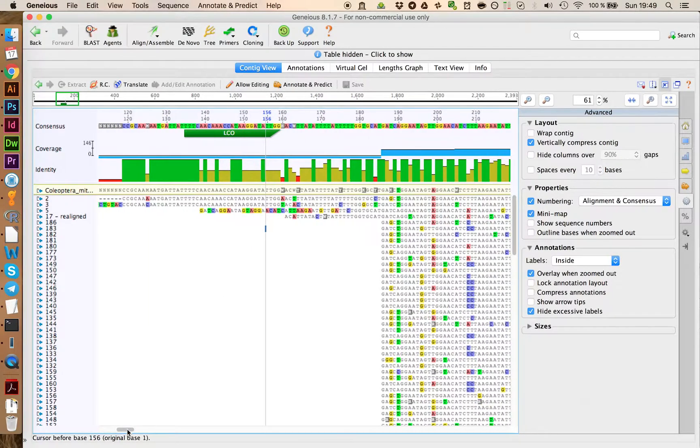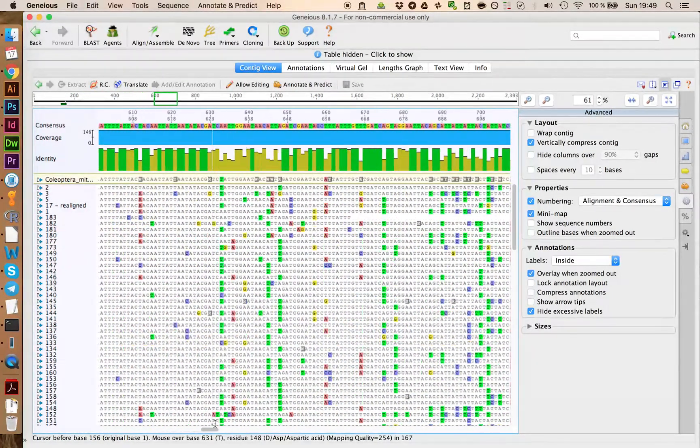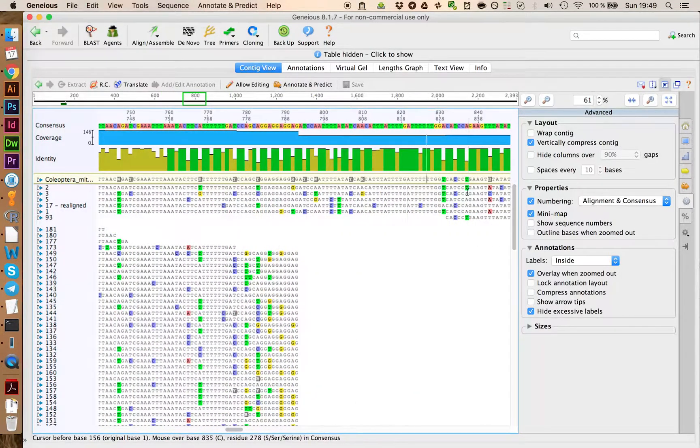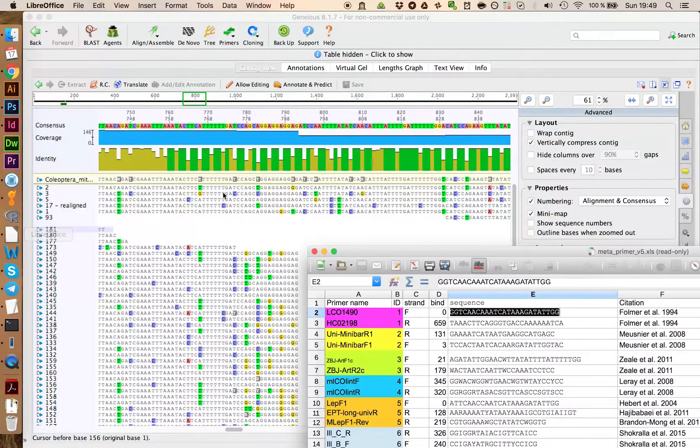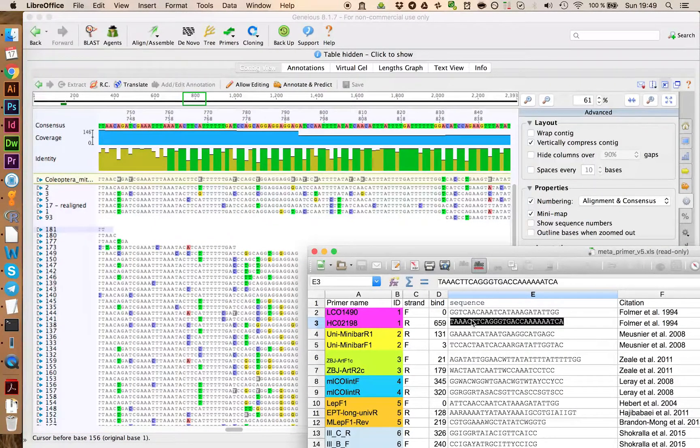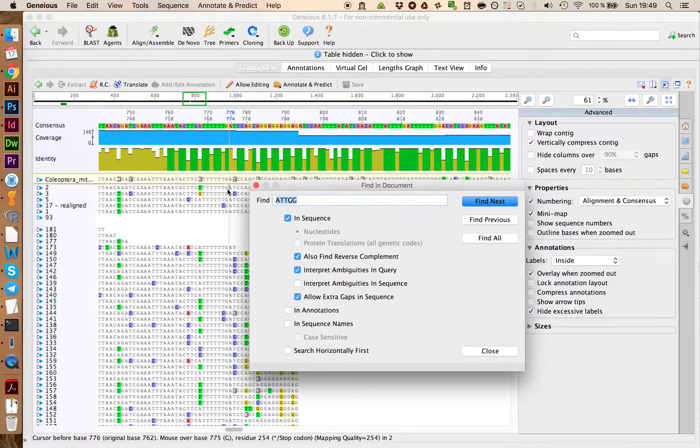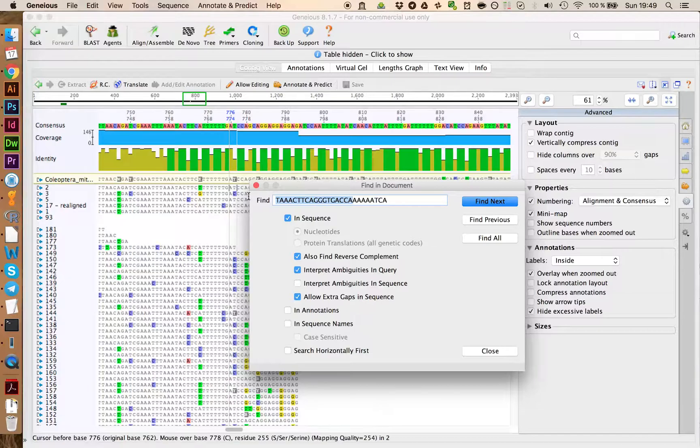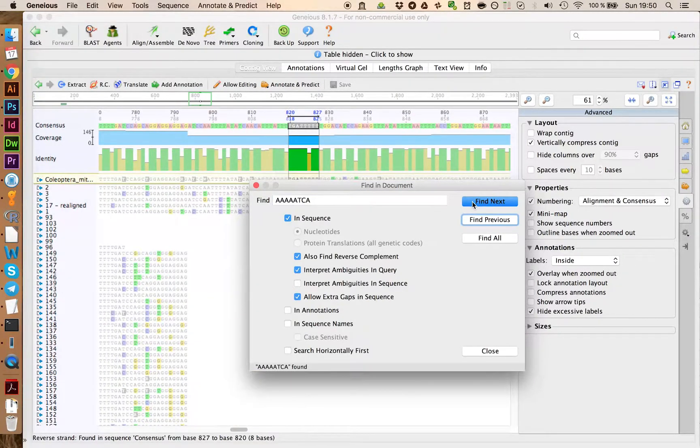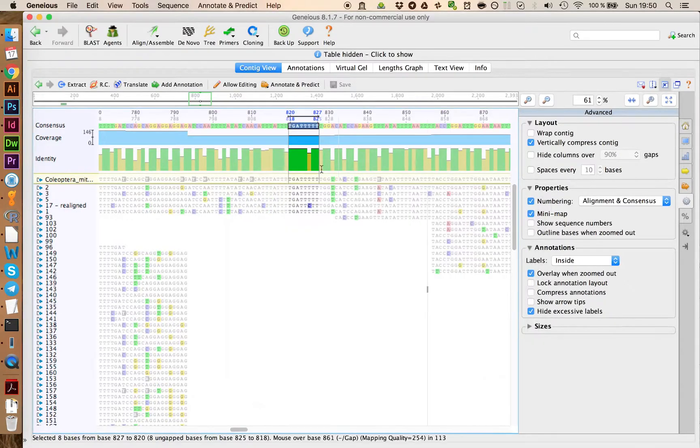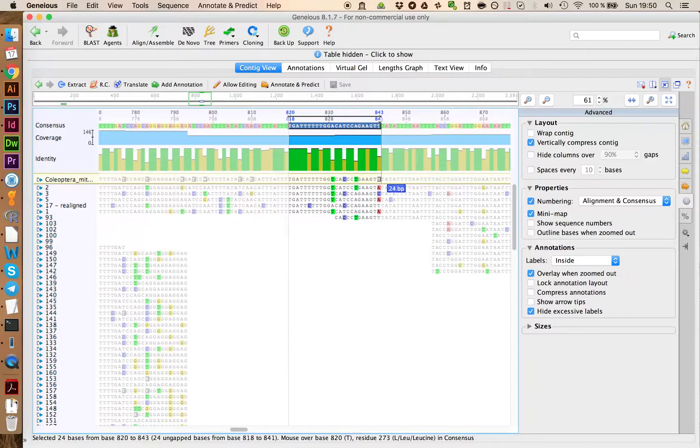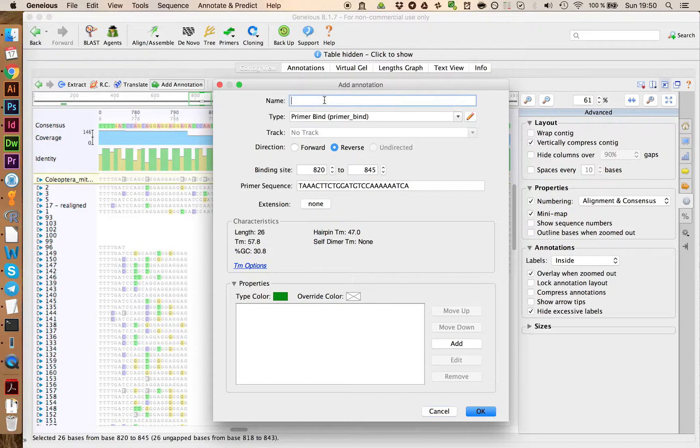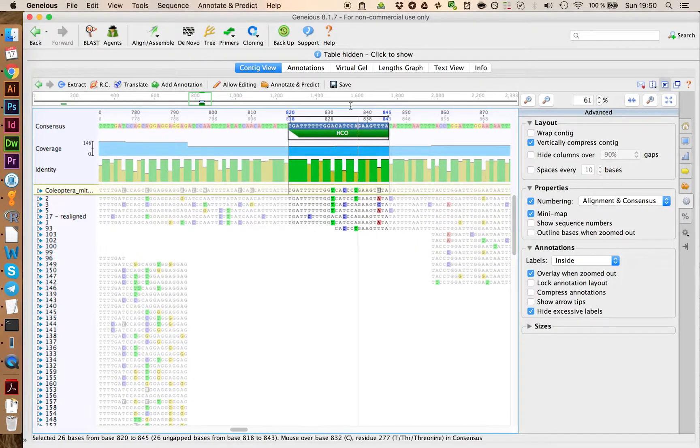From here, we're going to go to the other side. And somewhere in this region, we should again have the HCO primer. We can go and copy the HCO sequence and let's try to find it with searching here. Let's delete some of the bases. And we're going to go and find and we see it did find something here. So the HCO primer is 26 base pairs long. So we're going to add this as an annotation. Click on OK.